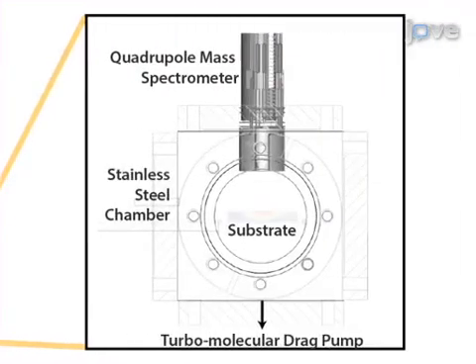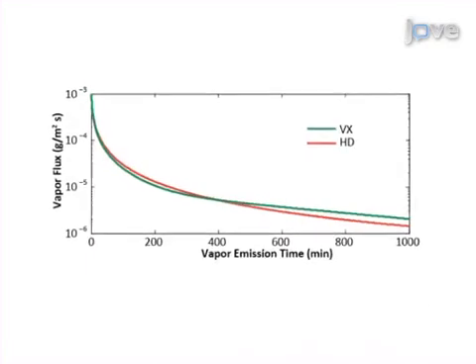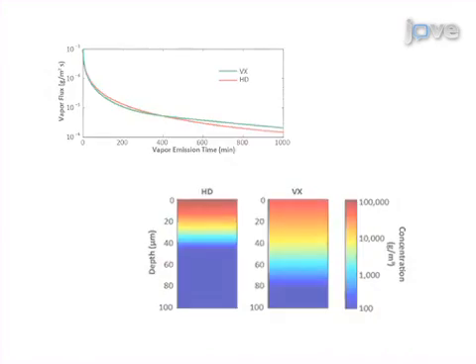As a second step, the contaminated substrate is placed inside the high vacuum experimental chamber, which characterizes the gas desorption profile of the contaminated substrate using a mass spectrometer. The results allow the determination of the saturation concentration and diffusion constant values for the contaminant transport through the paint based on the analysis of the measured mass flux of the contaminant from the substrate.